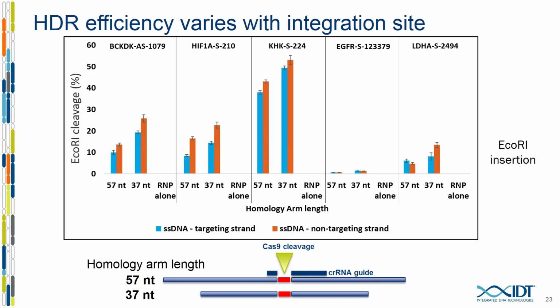So this tends to be very specific to both a guide RNA and the gene that you might be targeting, and might even be specific to the specific HDR template. So sometimes you do need to test more than one site, and we'll take a look at designing the actual HDR guides here.